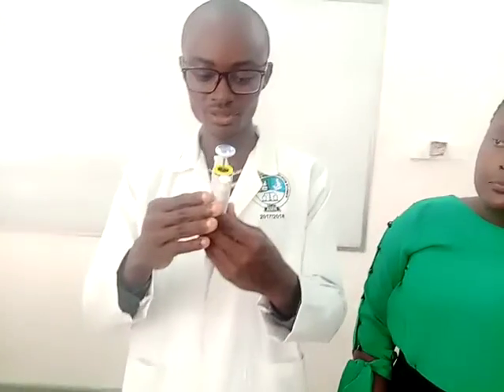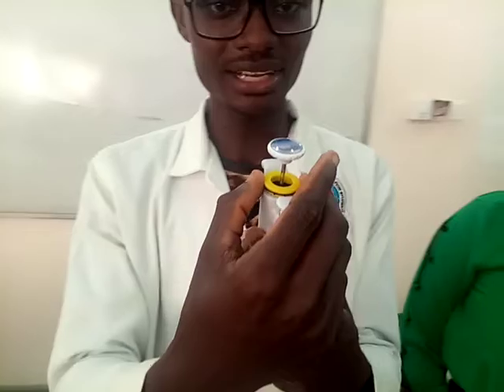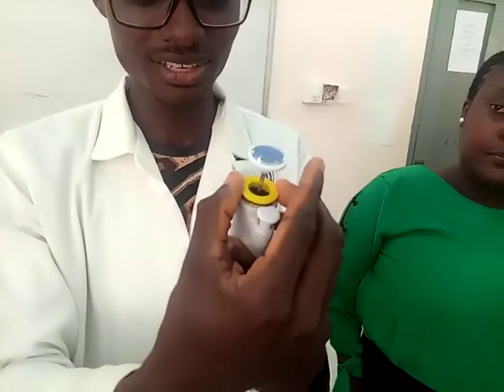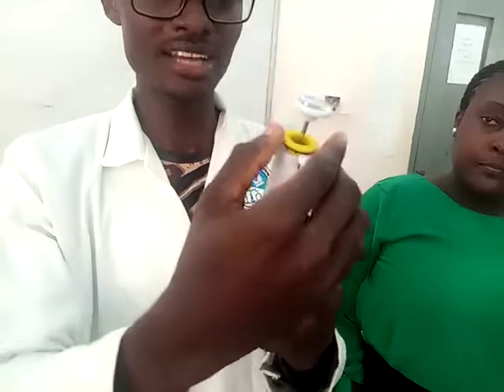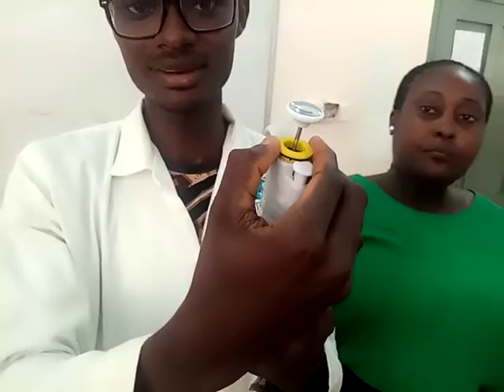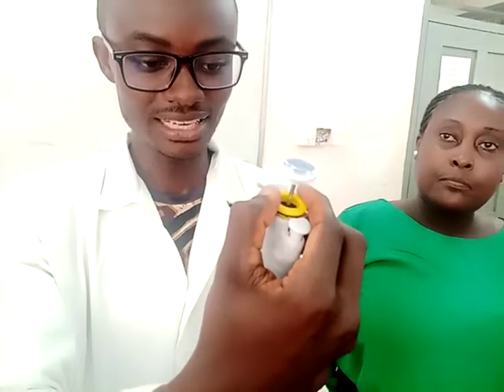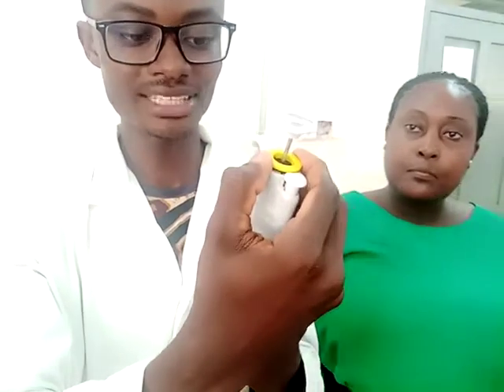Now, if I want to use the micropipet — for this instance it's the P-1000 — what I have to do is first set the volume of the micropipet. On setting the volume, what I have to do is lift the volume adjustment knob like this. Then I'll move it clockwise and counterclockwise. Moving clockwise will increase the volume, and moving counterclockwise will decrease the volume. So now I'm going to set it to 1000 microliters. I currently have 990 microliters, so I will move clockwise to increase the volume. Now I have 1000 microliters set. So what I will do is move the volume adjustment knob down like this. Now I have 1000 microliters set on my micropipet.